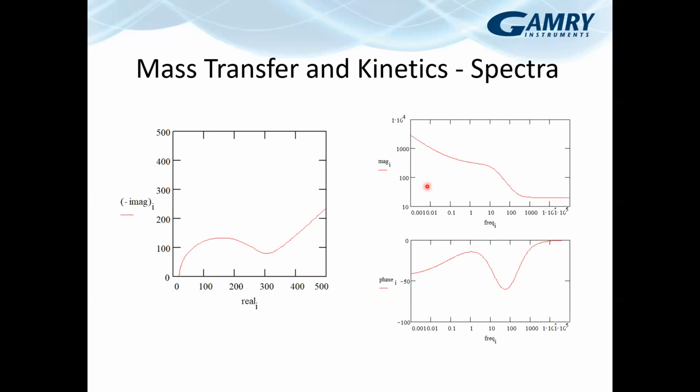What do these look like? This is what a mass transfer looks like, how it affects your EIS spectra. So that initial semicircle that we saw, or on the Bode plot, the sigmoid with the dip, starts out okay, but then at low frequencies, instead of coming back to the axis, it turns around and it just goes off at a straight line here, this 45-degree angle.